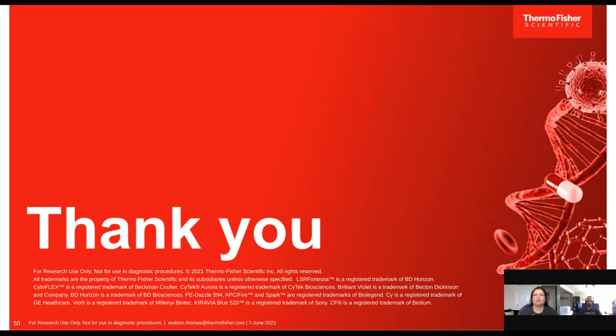Here's a really good question about Purple Rain. When are you planning to introduce 405 nanometer probes? I will say that it's definitely a work in progress and something that is pretty exciting for me, because one of the things I get to do, and Anson also does some work looking at these, is basically we do a lot of the dye vetting. Part of the process is testing whether this dye is brighter or has less spread than things that are existing. So I will tell you that those experiments are in progress, and there are some interesting candidates, but just stay tuned. We're definitely working there.